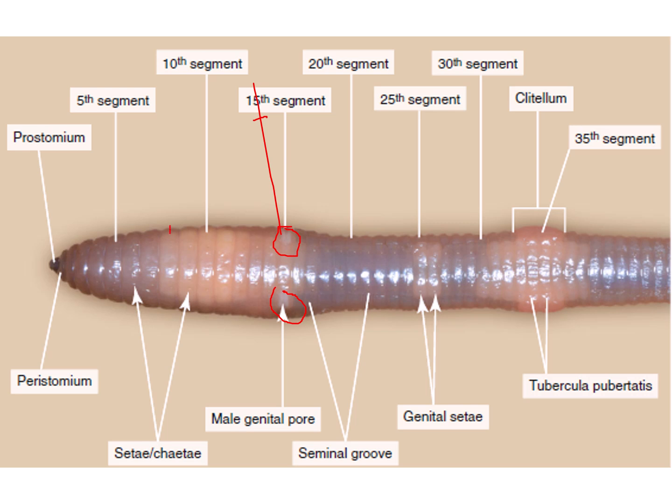So here at segment number 9, then segment number 10, and segment number 11. In these animals, Lumbricus terrestris, there are 3 pairs of spermatheca. Spermatheca are for storage of sperms of another individual that this earthworm got during copulation.